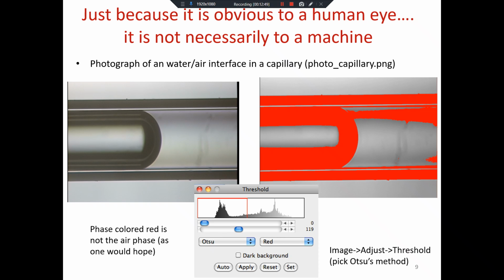Okay. So it depends on the method of the imaging. Is the imaging that you're doing actually clearly distinguishing different physical phases? Right? Here, I guess this one is outlining boundaries, but because of the reflection, it doesn't do boundaries sharply. So processing this to actually find the boundaries would require some tracing and a lot of input from the user.